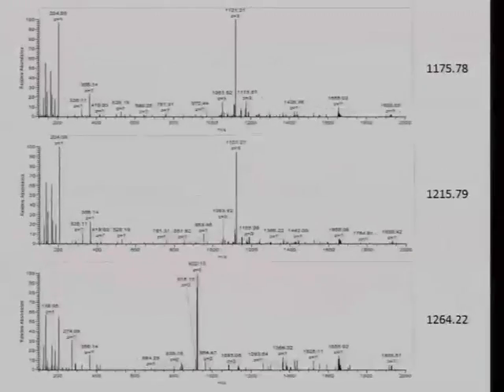And then the last one that was selected for fragmentation is this 1264. And this 1264, do we think this is the same peptide? No. No, this looks completely different. So we don't have the 1121, and we've got a fairly big 274 peak, which suggests this contains a sialic acid. So this is another glycopeptide, and it's not related to what we've got.